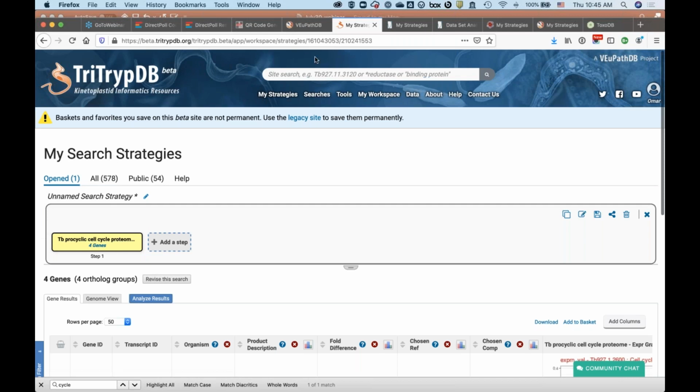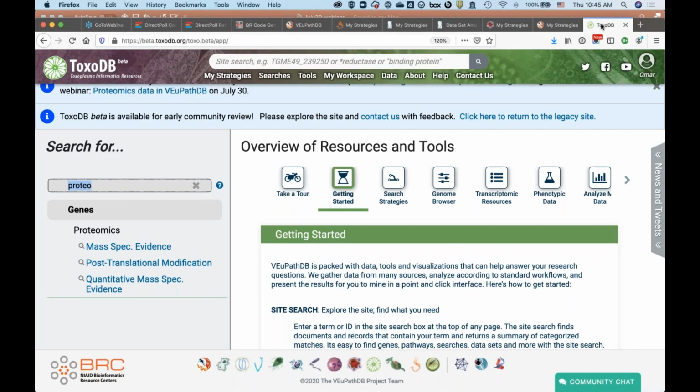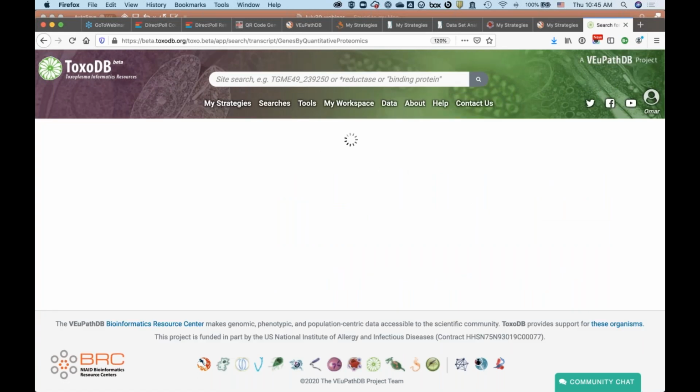Okay, so let me pause for a second and see if there are any questions in the question panel. I don't see any, I think. Okay, good. So we'll continue. The next thing I'm going to demo is, I think I will jump to ToxoDB. And again, I'm going to pick the quantitative proteome mass spec experiment, and let's take a look here.